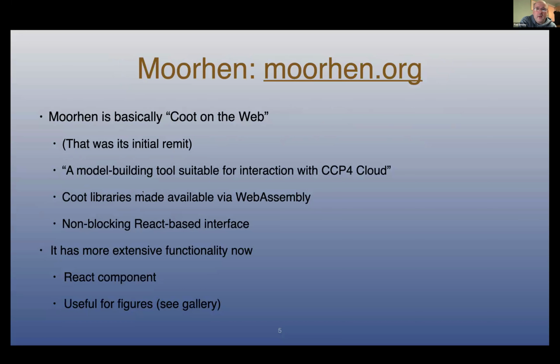So Moorhen is Coot on the web. That's what it was initially designed to do. What I needed to do was split up Coot for the calculations and representation.